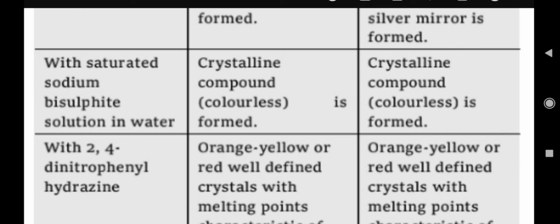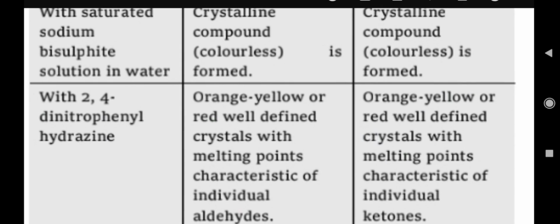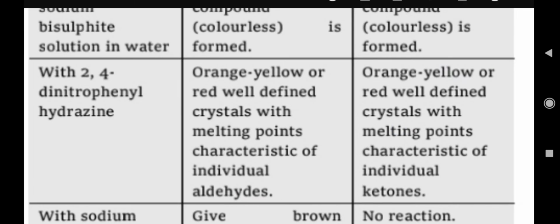Next one is with 2,4-dinitrophenyl hydrazine. Orange, yellow or red well defined crystals with melting point characteristic of individual aldehydes are formed, while orange, yellow or red well defined crystals with melting point characteristic of individual ketones are also formed, which means both give the test with dinitrophenyl hydrazine.